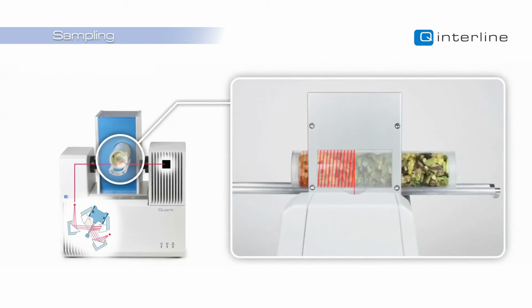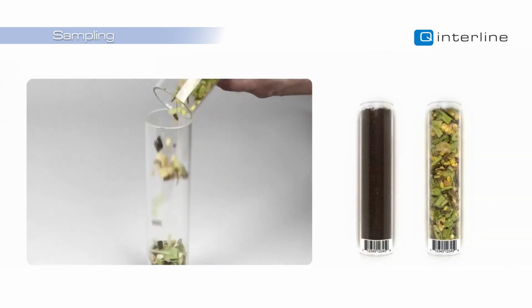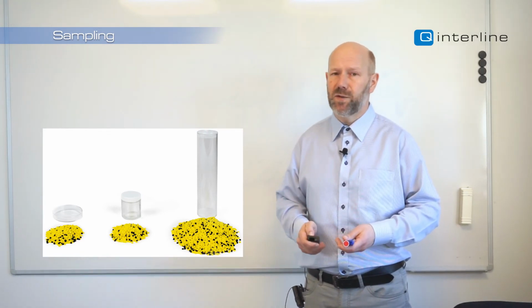of 375 square centimeters. Easy to fill and sees an enormous area. And that will turn out to be the right choice here, hence for binary heterogeneous samples.